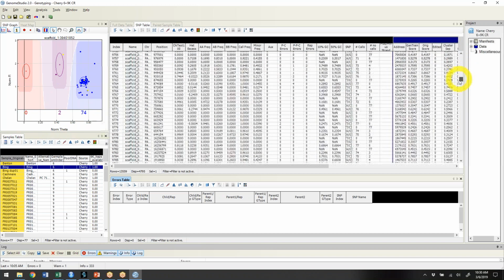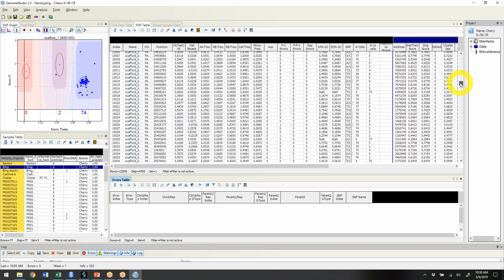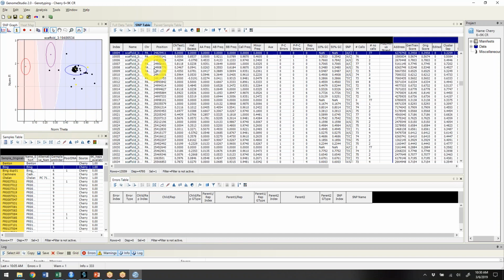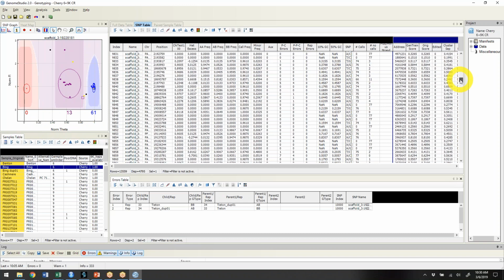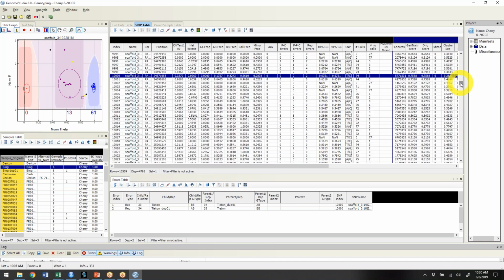So if I wanted to go to, let's say, SNP 1000 and I just missed it, or SNP number 10,000 and I just missed it, I could try to fine-tune it by scrolling here, or I can just click on this and then use my mouse wheel to scroll up. Because if I don't click on the sample here right now, as I showed before, then I just jump back up to where the last SNP was that I highlighted. So that's just a little trick in GenomeStudio.